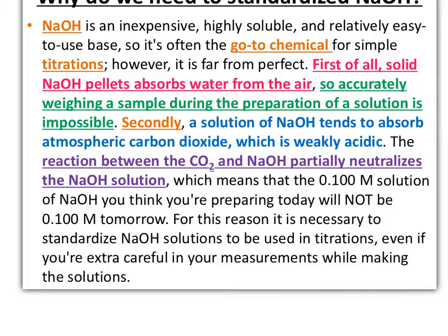So what's that going to do to your calculated concentration? The actual is a little less than calculated because of the water that was present. That's basically hydrating the solid. So accurately weighing a sample during the preparation of a solution is impossible because even while it's sitting on that weigh boat, it's absorbing the moisture from the air.